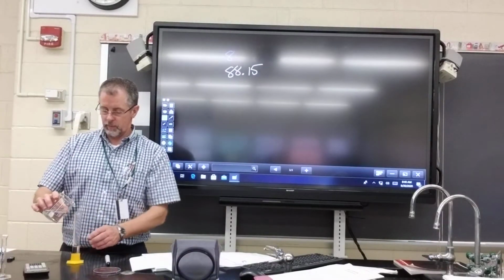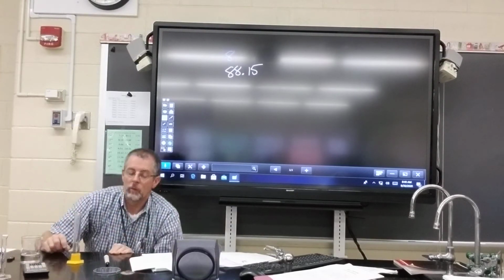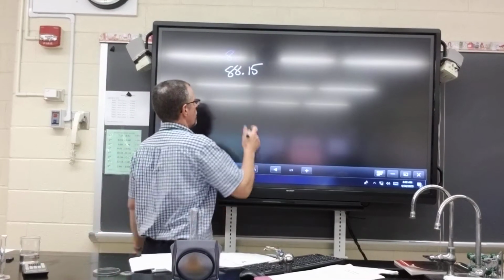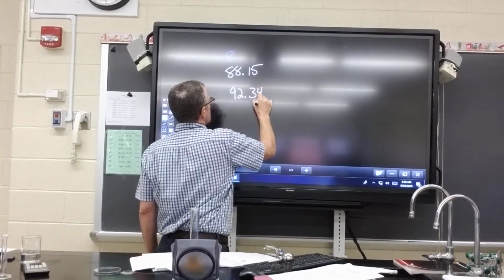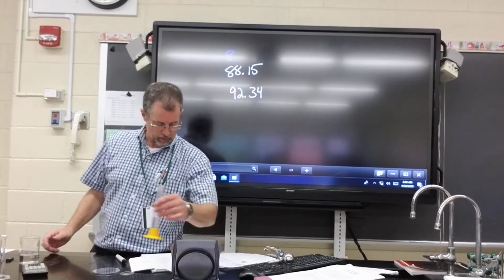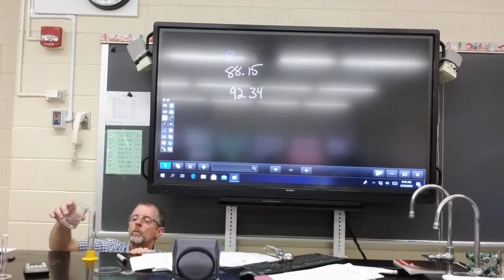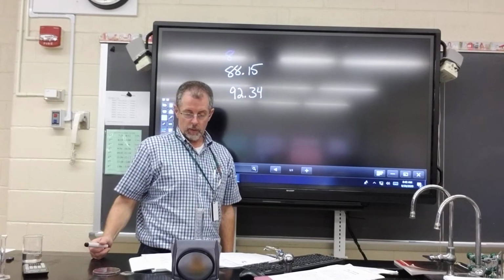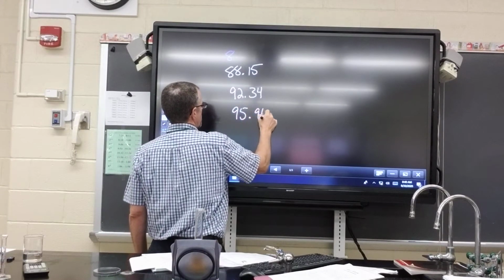For 25, I have 92.34 grams. And then finally, for 30, I have 95.96.